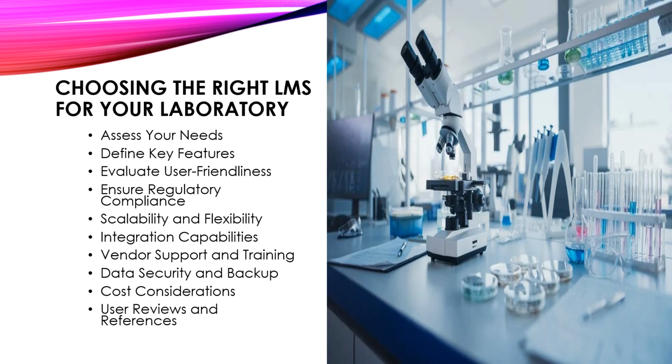Scalability and flexibility. Consider whether the laboratory management system can scale with your laboratory as it grows. It should be flexible enough to adapt to changes in testing volume, new testing methods, and evolving regulatory requirements.